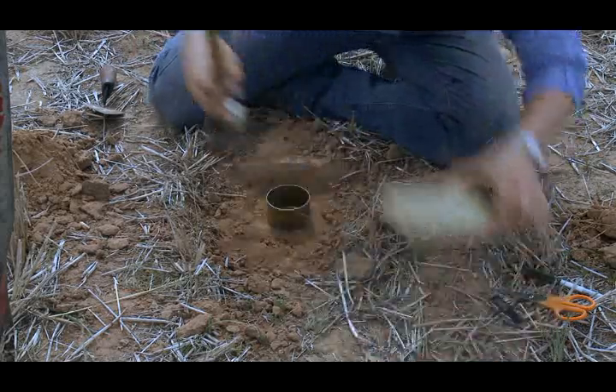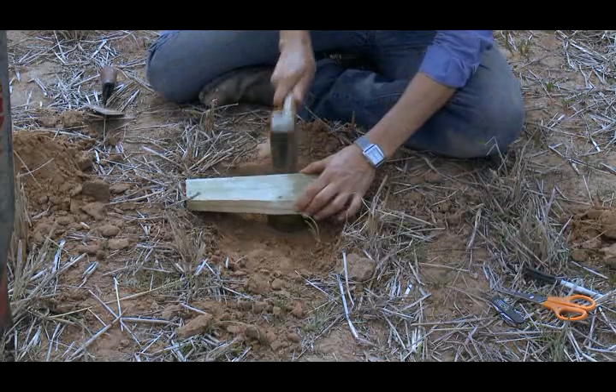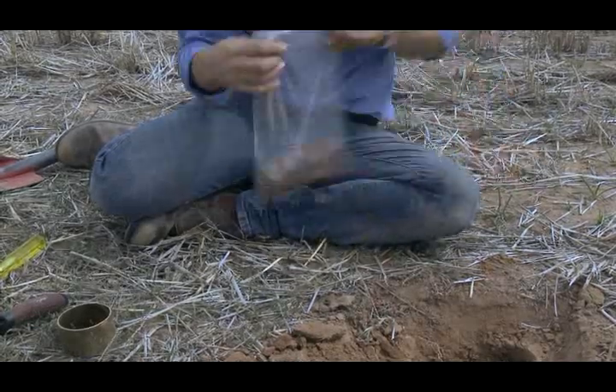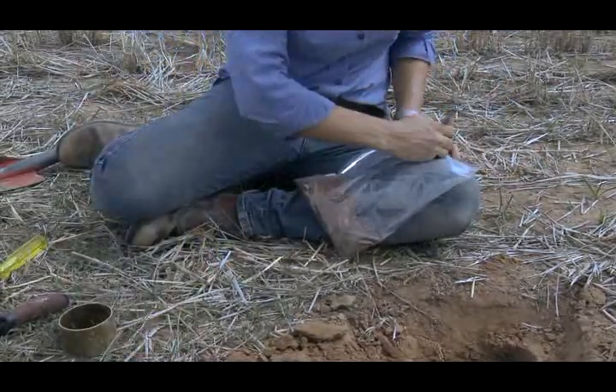Step 8. For the sample at 5-10cm depth, repeat steps 2-7 at the same site. Step 9. Place the core in a separate bag marked as in Step 7, but with the 5-10cm depth.